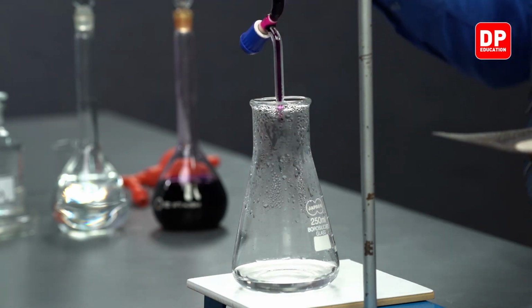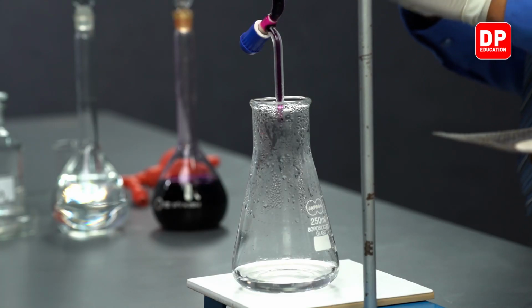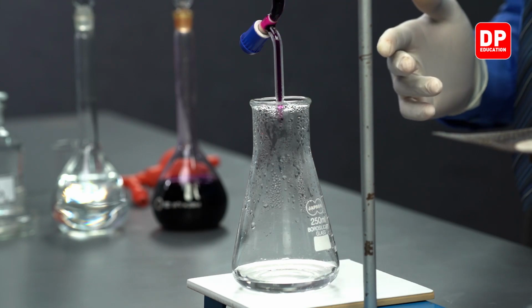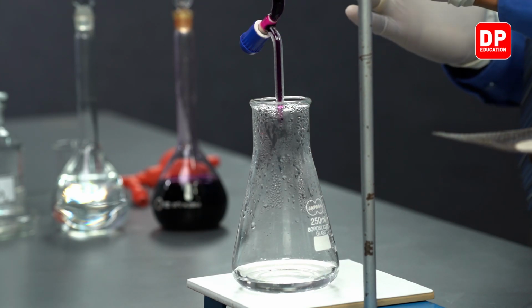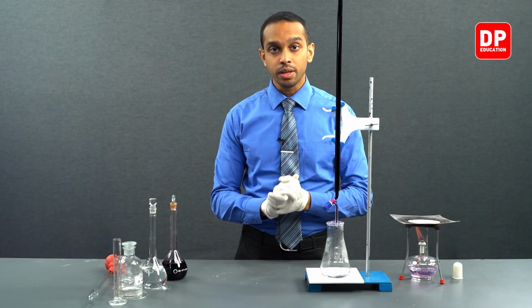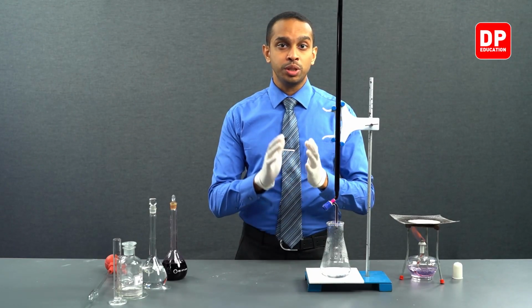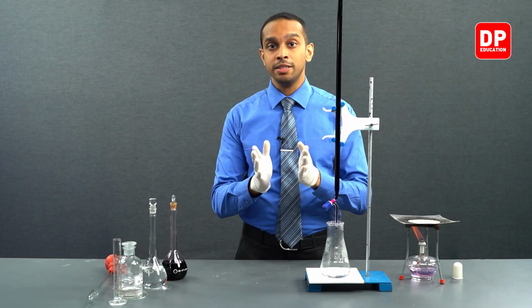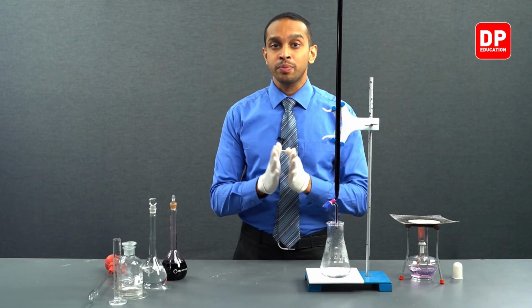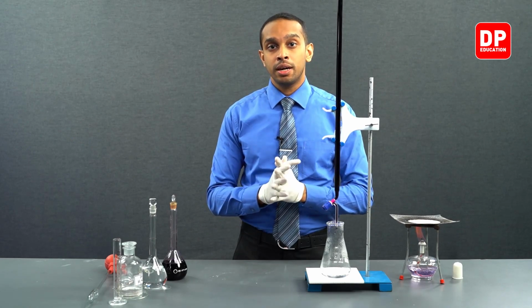This is because the potassium permanganate reacts with the oxalate anion and converts MnO4 minus into Mn2 plus. MnO4 minus is a dark purple color with a high color intensity, but when you turn MnO4 minus ions into Mn2 plus, the color of Mn2 plus is almost colorless.